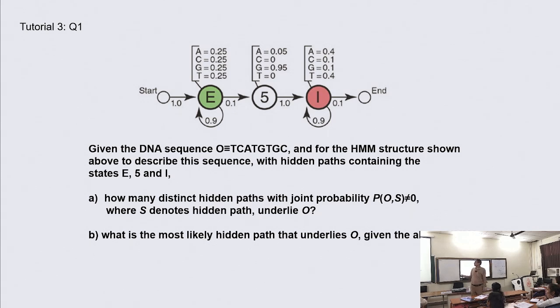One is, okay, 5 is here. So 5 is here. This is the boundary, and to the left of the boundary, these two are exonic, and to the right are intronic, right? Then you have the second one, this G as the boundary, to the left exonic, and to the right intronic. So you have three paths.